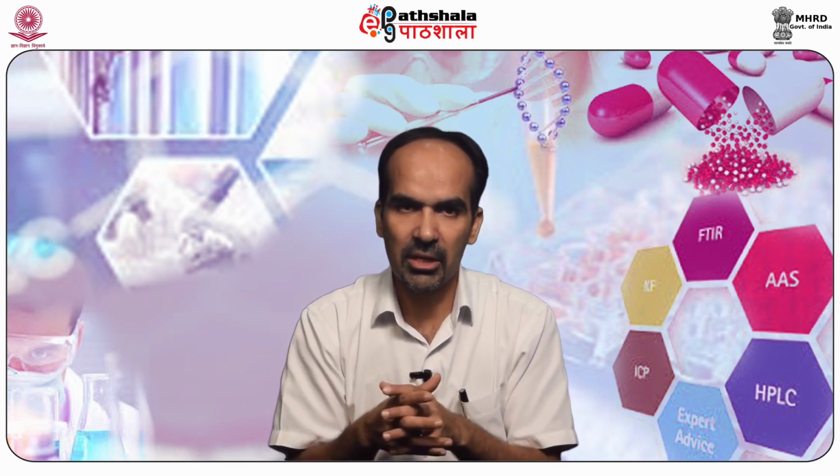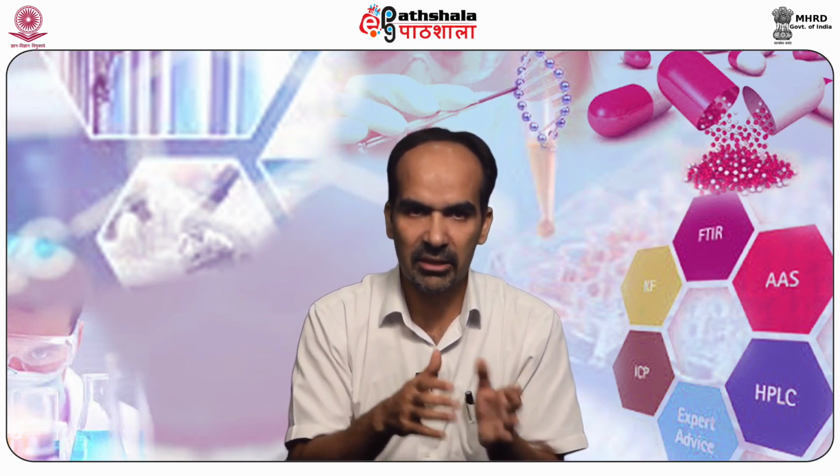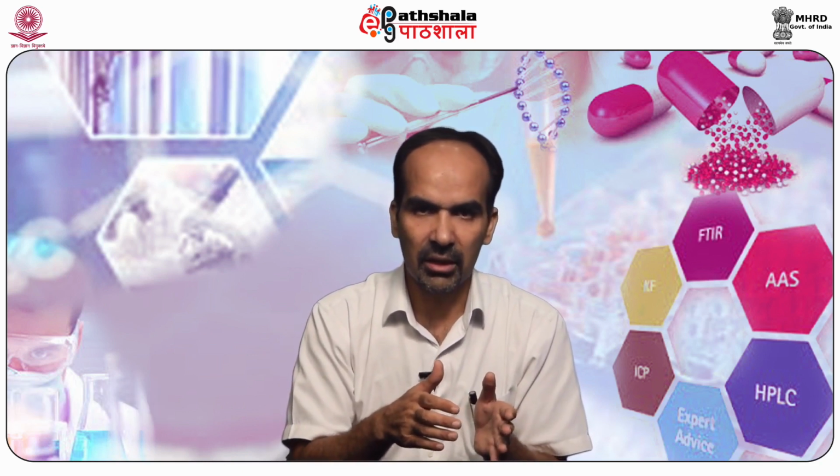The third property is that alkaloids are liberated from their salts by alkalis. The methods employed involve the use of pairs of immiscible solvents, such as water and ether or water and chloroform.